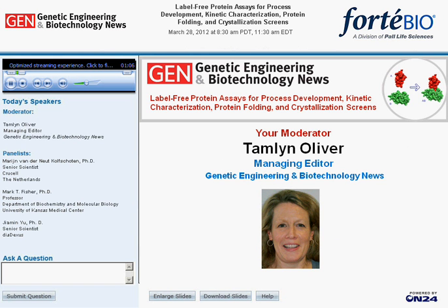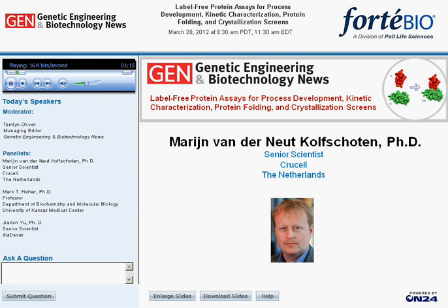Marin is a senior scientist at Crucell. He uses BLI technology to improve the selection of therapeutic mAbs against viral targets. He uses the Octet system for both quantitative and qualitative applications, including protein A quantitation, binding kinetics, competition experiments, and sometimes even mechanism of action experiments. Marin, we're ready when you are.